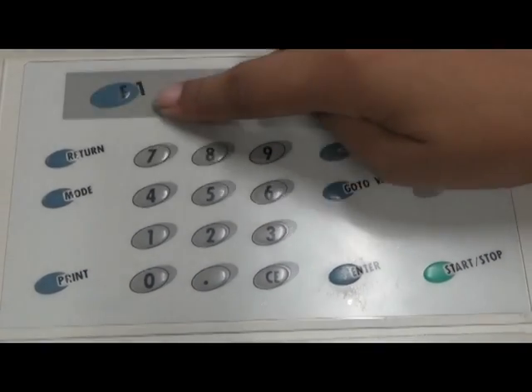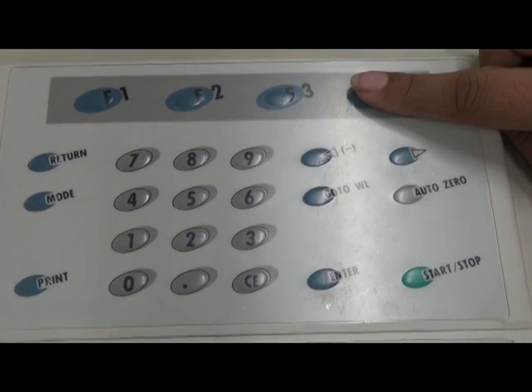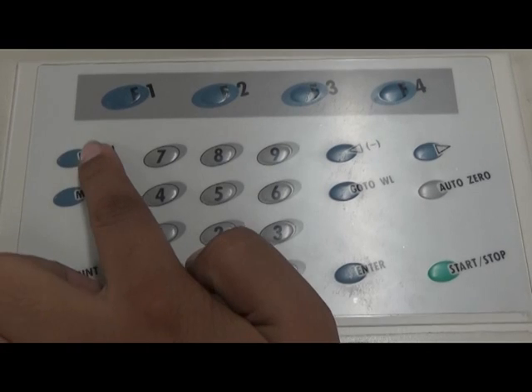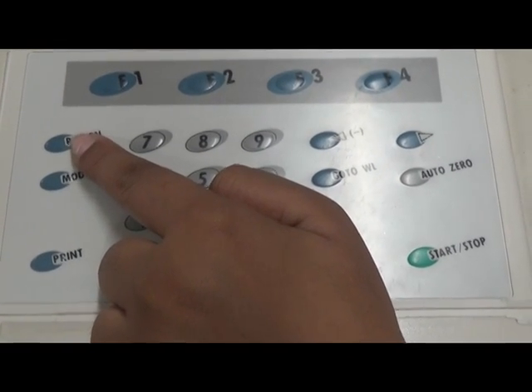These are called function keys. These are the keys corresponding to the functions that are displayed at the bottom of the LCD unit screen. This is called the return key. Use this key to return to the screen preceding the current screen.